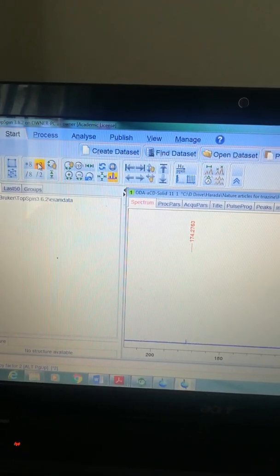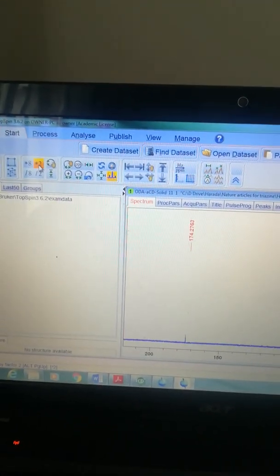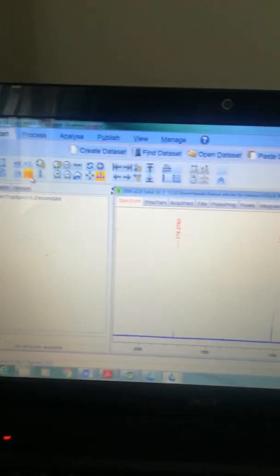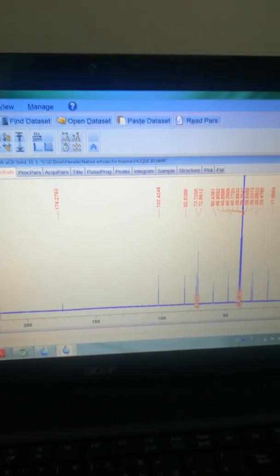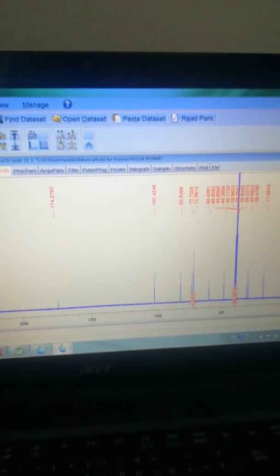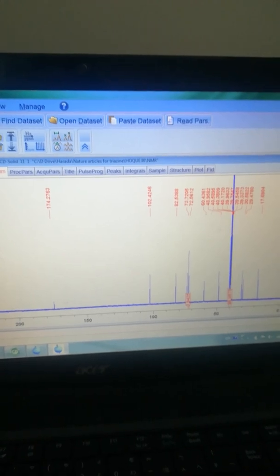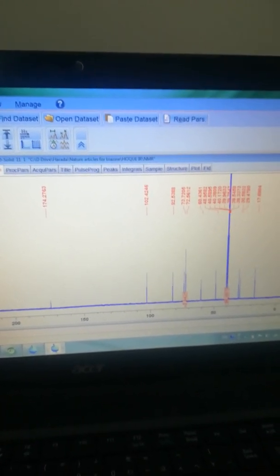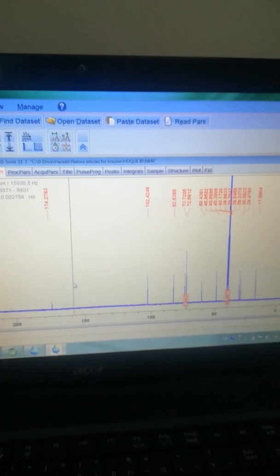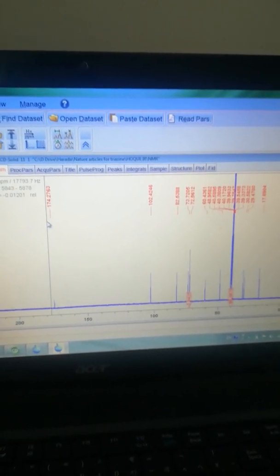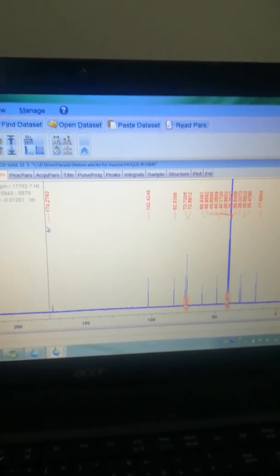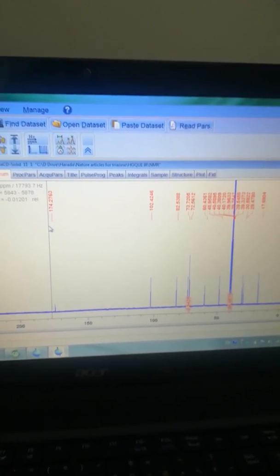You can expand the spectrum using the expanding option. You can increase up to two-fold by clicking here, and you can decrease as well. Now the NMR spectrum is appearing in a good way. Already a peak picking has been created automatically.